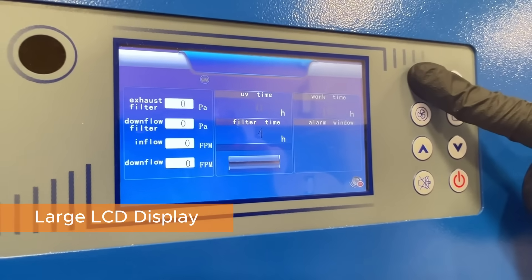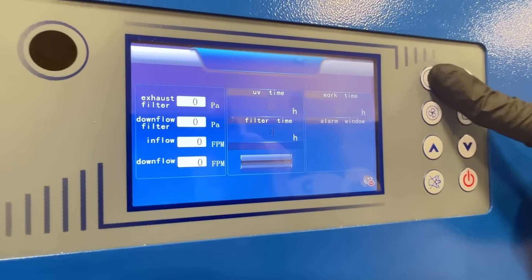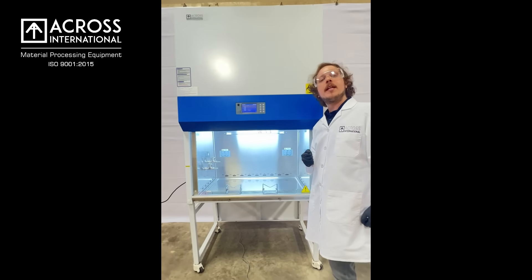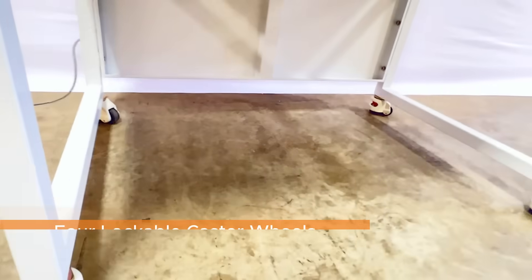On the LCD screen you will see a work time counter that also allows for counting the hours on the UV light and the HEPA filters, in order to make maintaining compliance in your laboratory effortless and easy, allowing you to focus on your work.